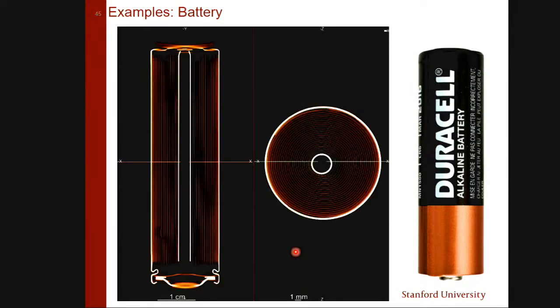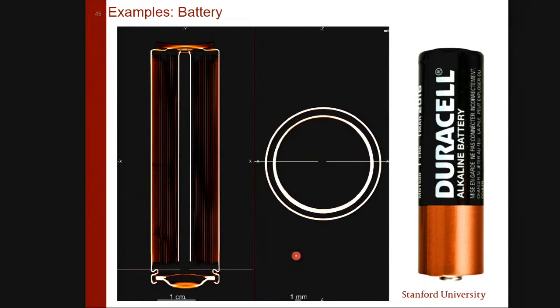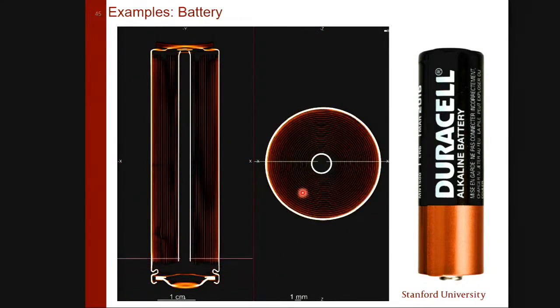And you can investigate that battery by looking through here and seeing, for example, if there is any damage within these different rolled electrodes. And when you cycle the battery, the damage might appear at some point. And then you can relate, okay, at this point I have a damage, so then maybe we can mitigate that.